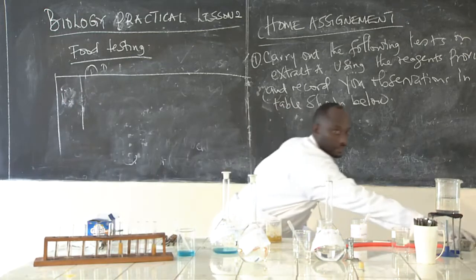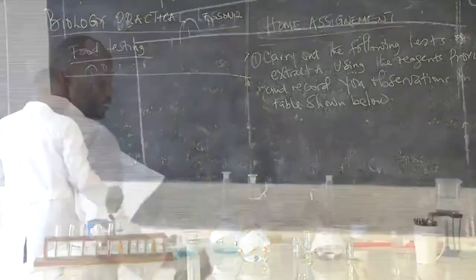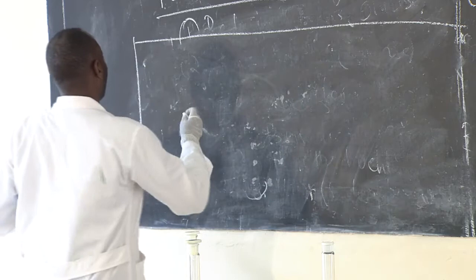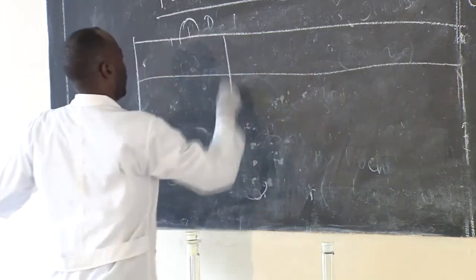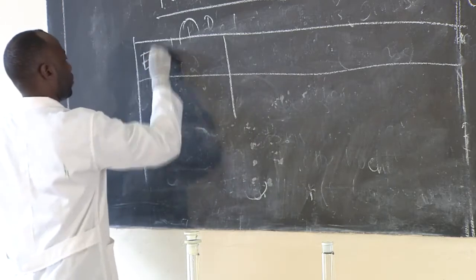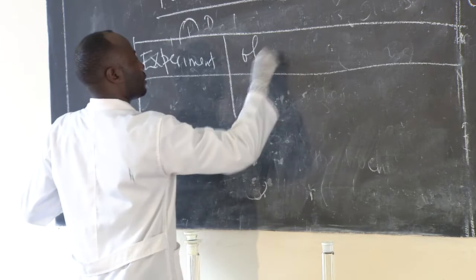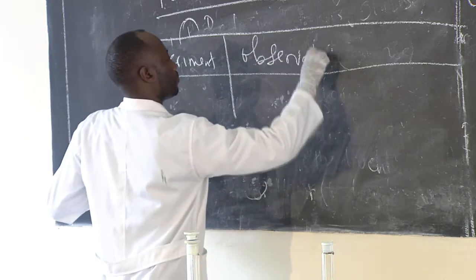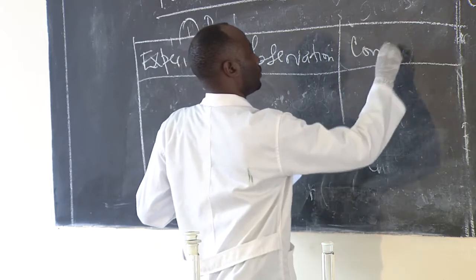Let us screen very quickly. You can say this is the experiment, observations, then conclusion.